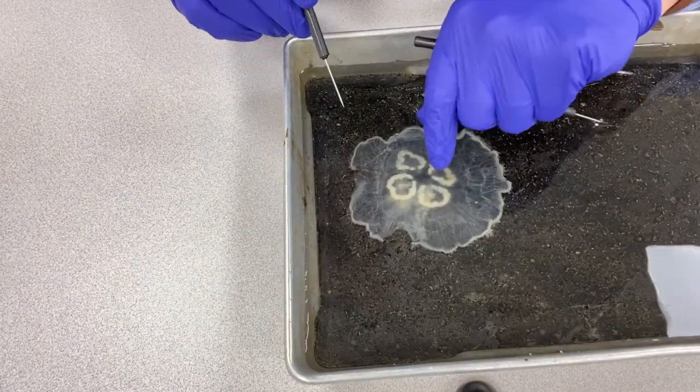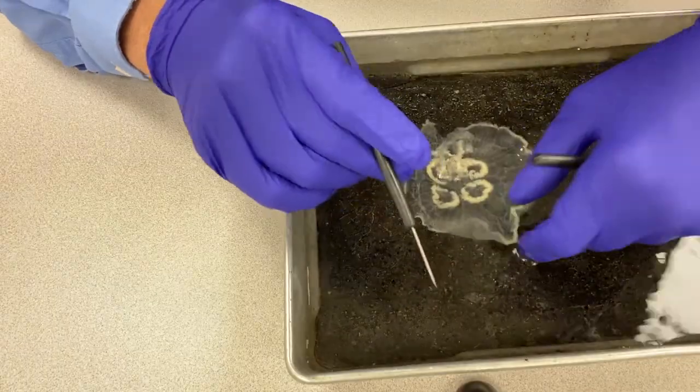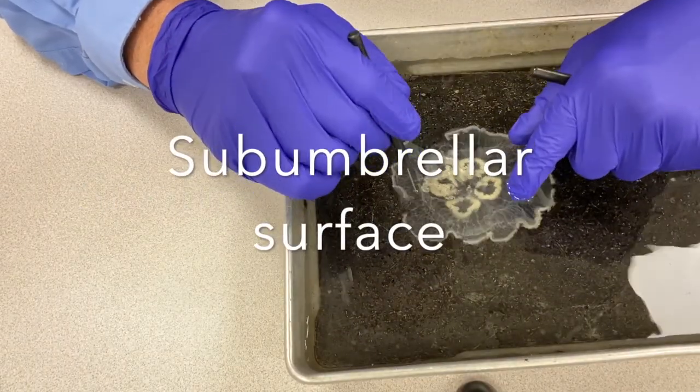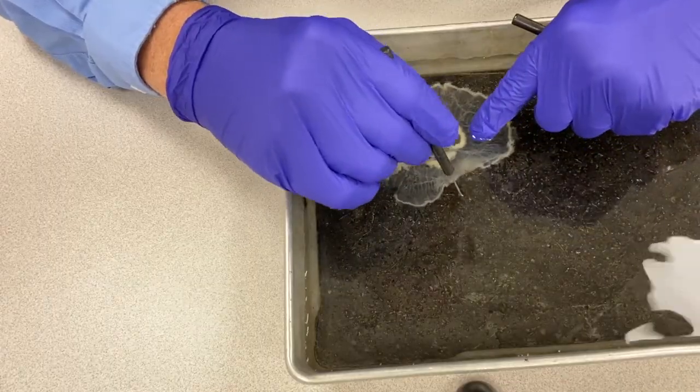I'm going to flip this over now — it's quite delicate. Alright, this is the subumbrella surface.